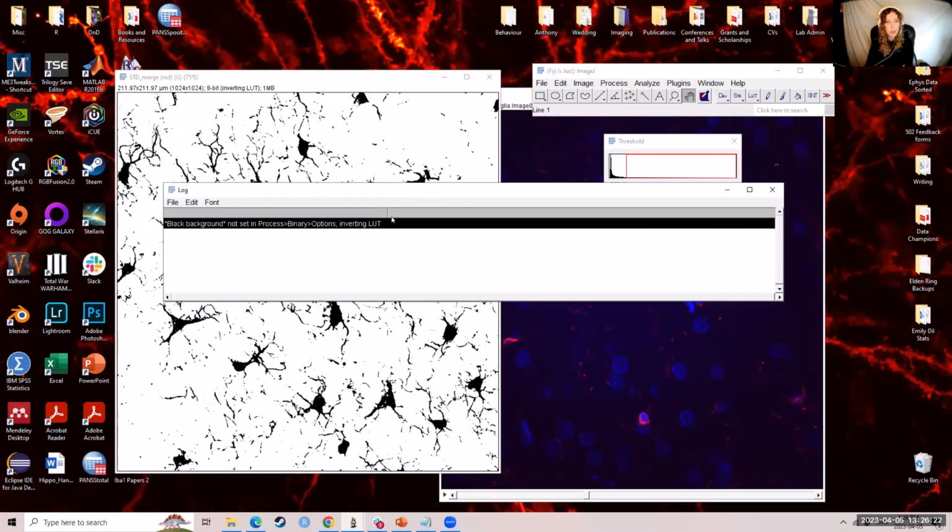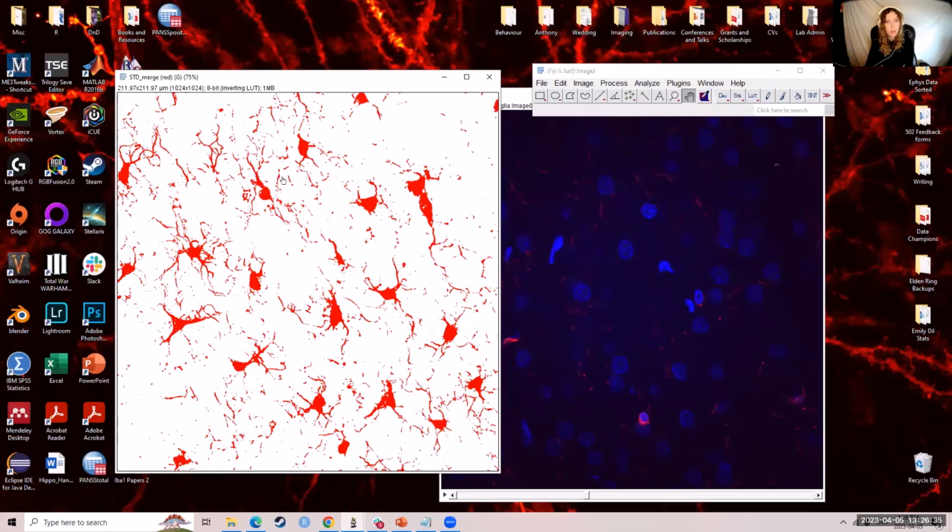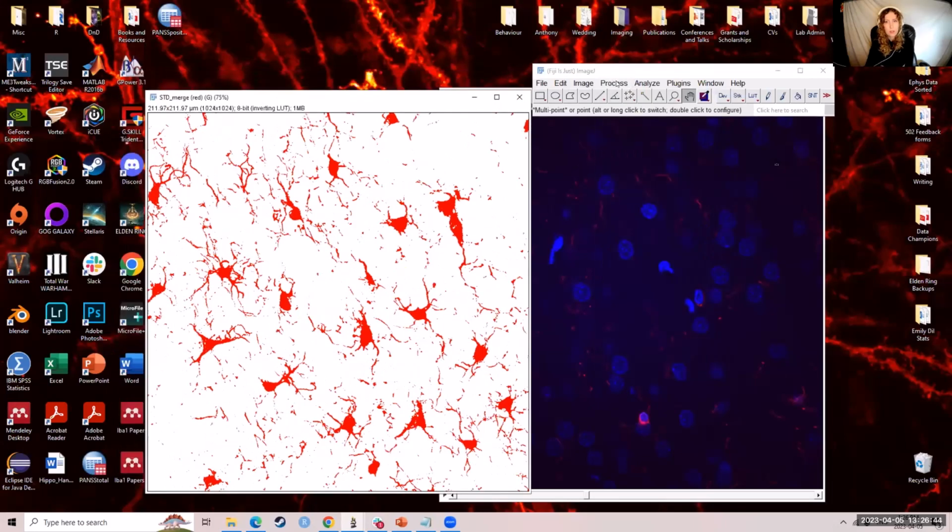And this is a new thing that has only been happening for me in the last couple of days. It doesn't seem to make a difference, but if you find that it is messing with your stuff, you just go process binary options and invert LUT. So that should be good. I'm not sure why this is showing up as red. So that is weird.